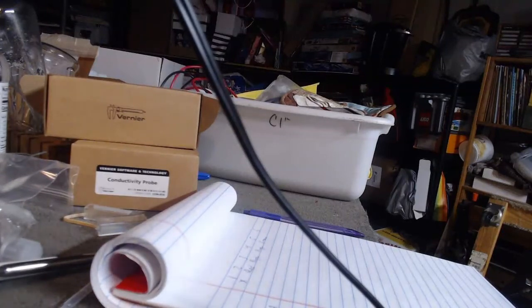Hello, this is the third and final video for gel electrophoresis. We're going to look at the results from the gel. First of all, let's review what we had loaded on there.